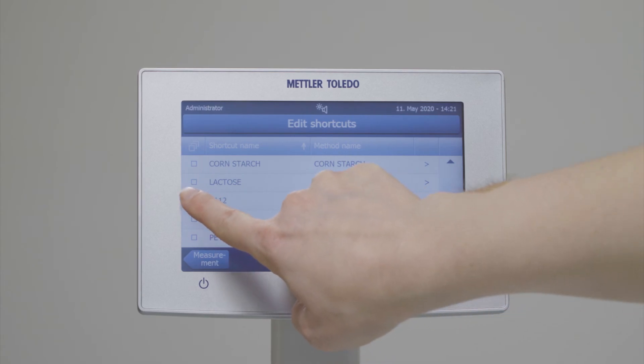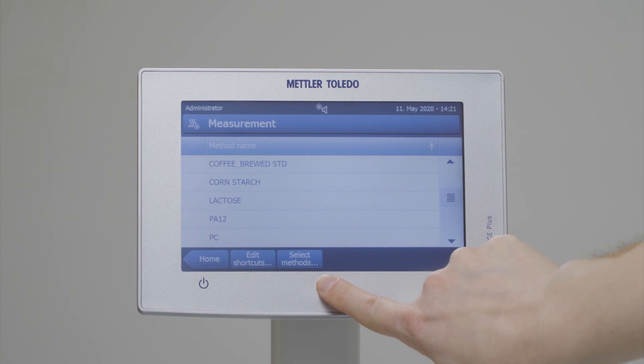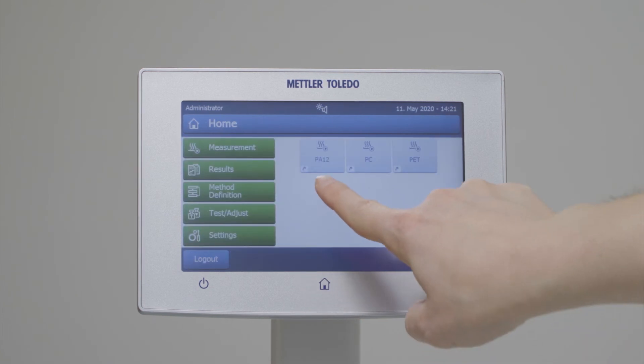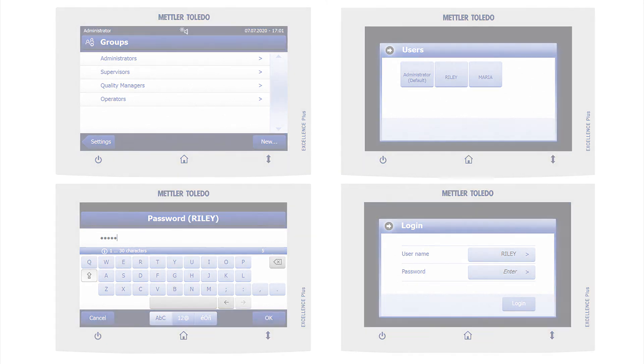Compared to a chemical analysis of the moisture content, a moisture analyzer is easy to use even by less specialized workers. Features such as method shortcuts on the home screen, customizable user groups and password protection make the process easier and safer.